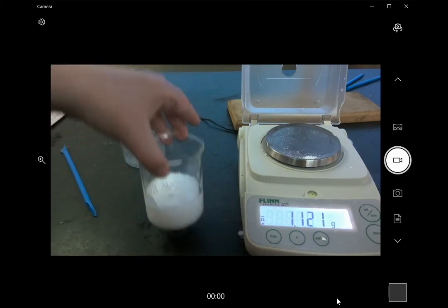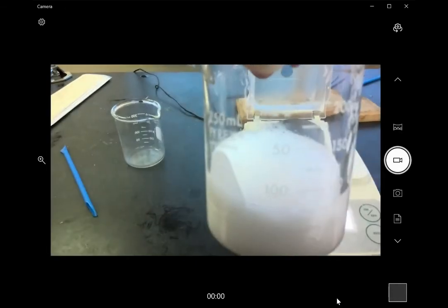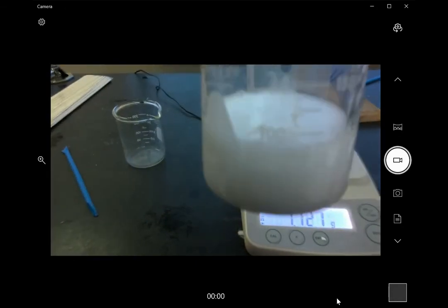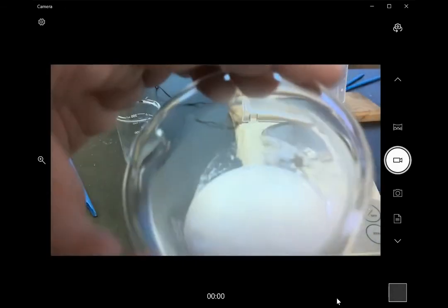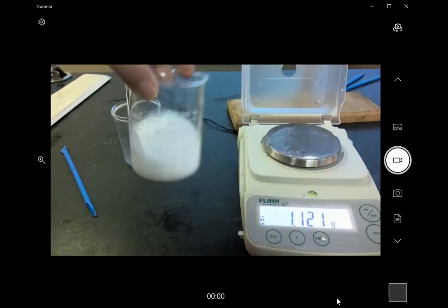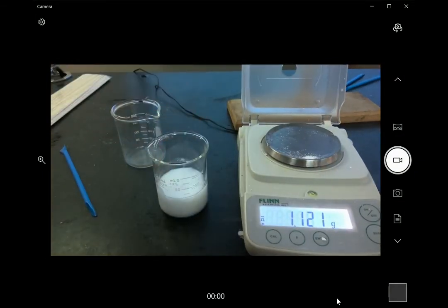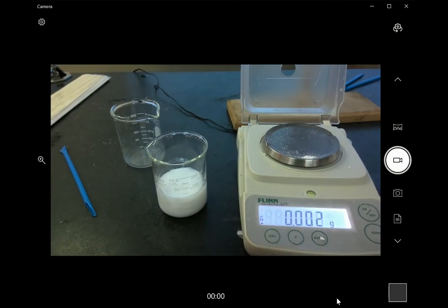And you can see that we get this white precipitate. It's a little bit chunky, it's definitely got a precipitate in it. So that's what we're going to be filtering out. We're going to need filter paper, so we need the mass of that. I'm going to zero the balance.